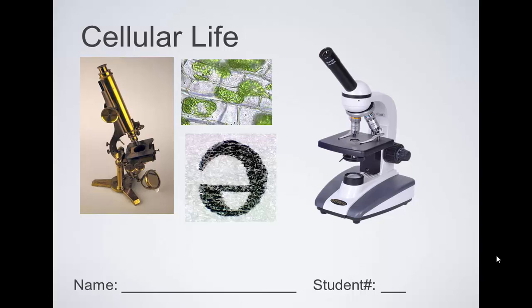Exactly. What do we call that glass part? The eye. Well, there's an eyepiece, but just a general. Not quite. There's another term I'm looking for, Caleb. A lens. So it really took people to figure out how to make a good lens.